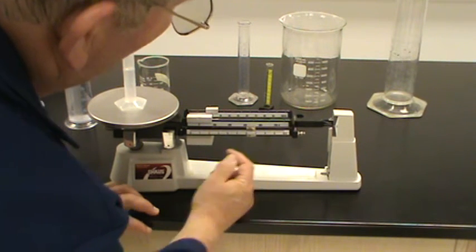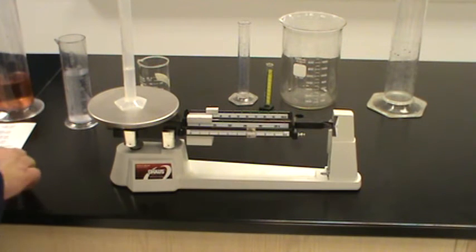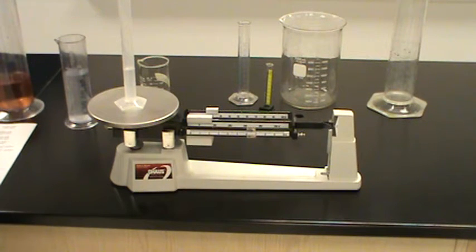With 16.8, I've got it to balance at 26.5. So the difference between the two is 9.7 grams. What can we conclude?